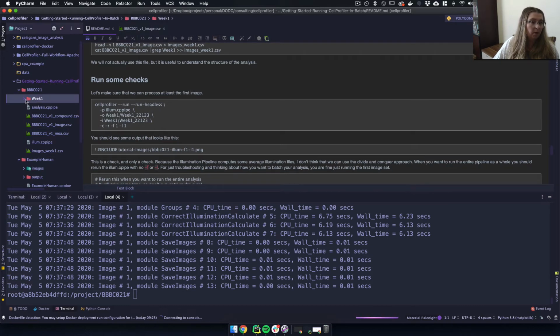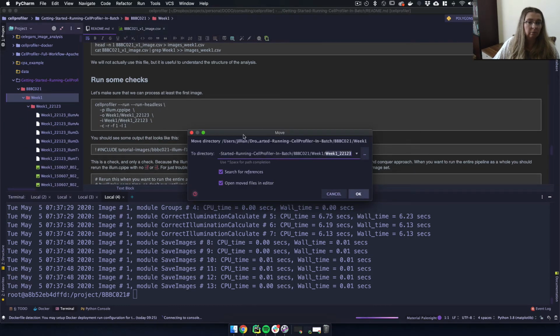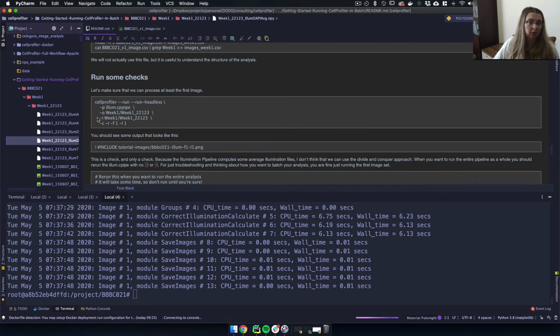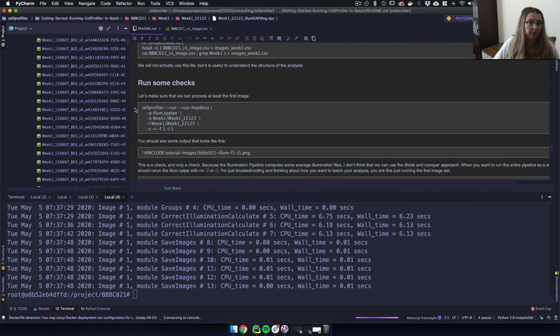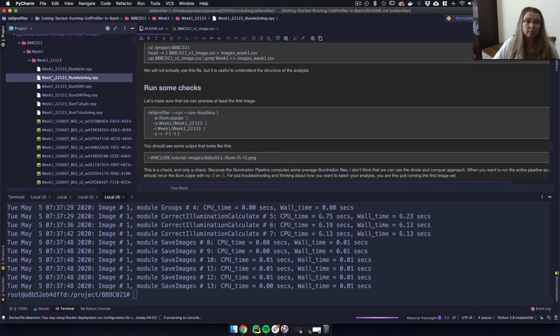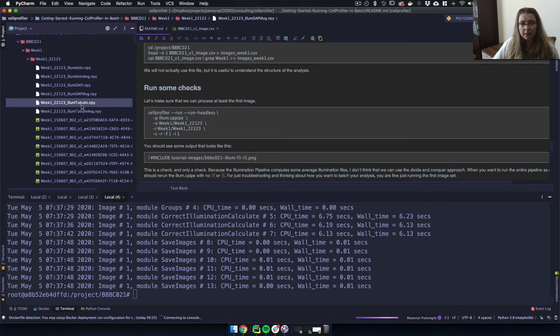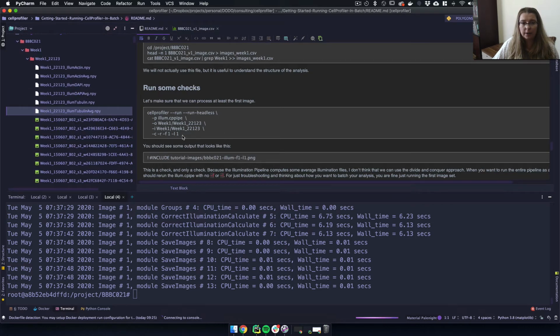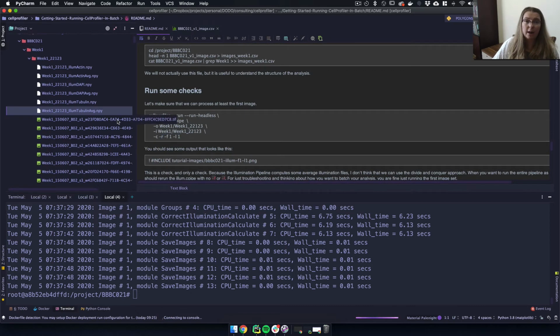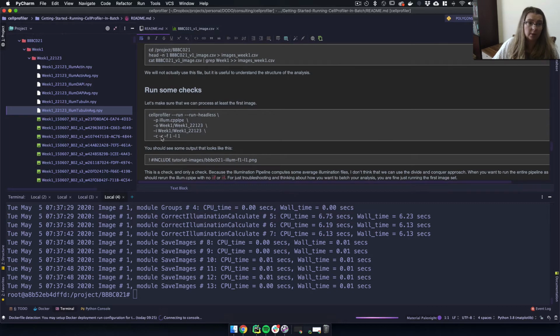Okay, and then we can go and look here. This isn't something that I can actually open because they're NumPy files. So you'll see here that we have this illumination actin average. This is why you would need to run these. Don't do what I did. Don't use this first and last flag. Make sure that if you're actually running this pipeline, you're running it without this, because it's calculating that average across all the images.